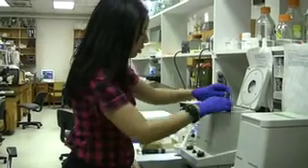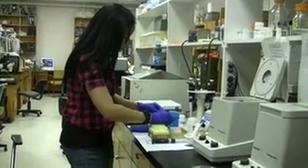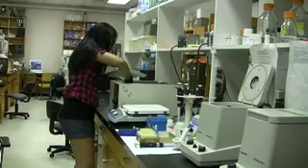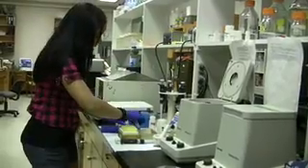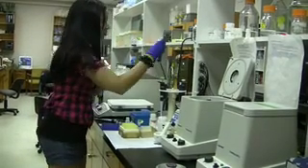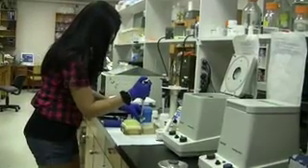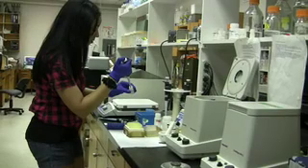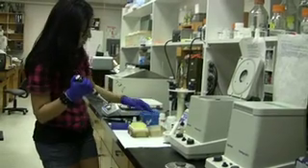It's done centrifuging. I'm going to go ahead and take it out. Place the columns into a new tube and take the buffer out of the preheated water bath. I'm going to take 100 microliters of this and place it into each tube. After I put 100 microliters into each one of them, it's going to incubate at room temperature for five minutes.